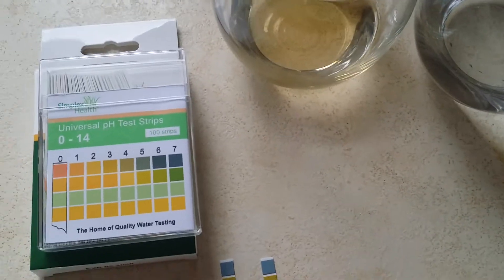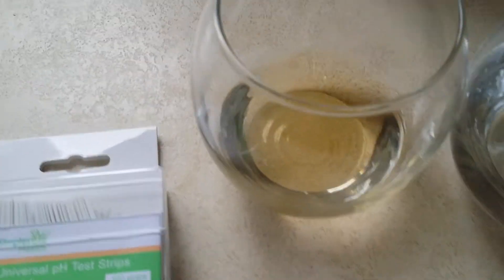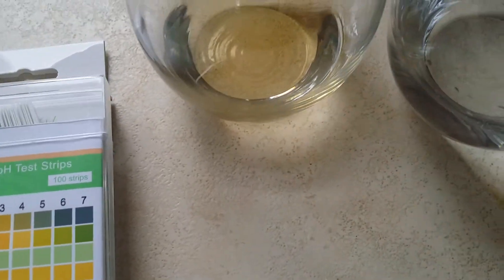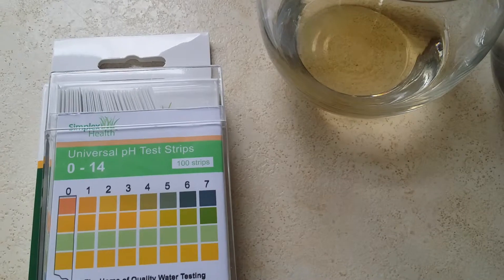Hi there, this is John from Simplex Health. I just want to quickly demonstrate how you can test the pH of vinegar and also water. The reason I've chosen vinegar and water is vinegar always has a low pH, usually around 2 or 3. Water has a very neutral pH, usually around 7.